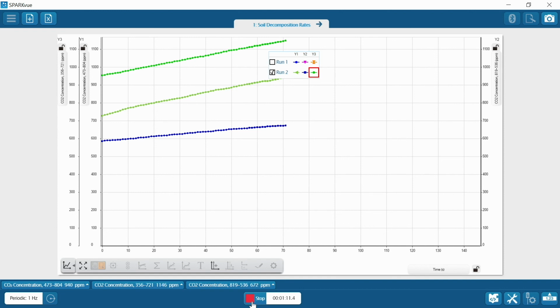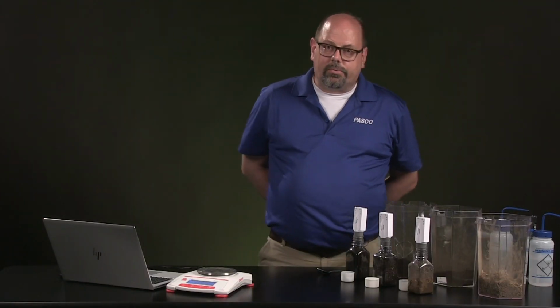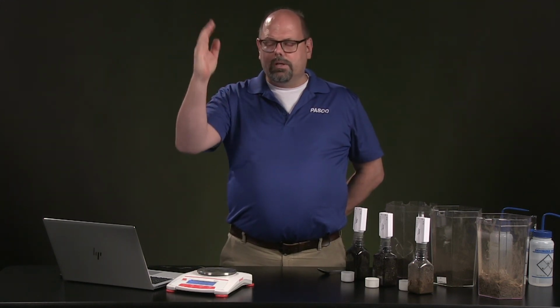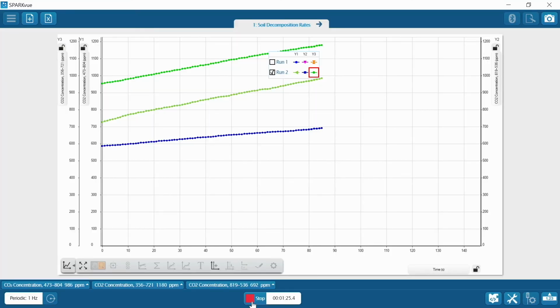Okay, they look like they're pretty consistent. I'm going to go for 1.5 minutes. I don't see any changes. I would say as long as you run out to 3 minutes, if you notice that the slope's going this way and then changes direction, gets steeper or a little shallower, run it until you've got a nice consistent set, because it's the slope we're interested in. So there's about 130. I'll go ahead and stop.